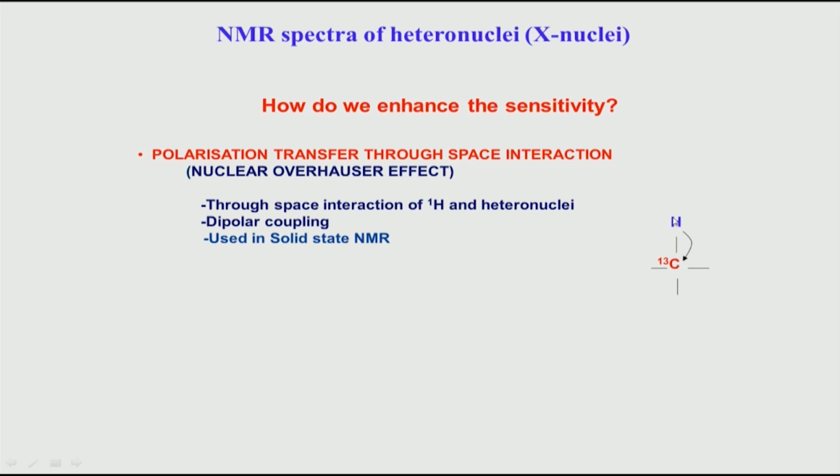One bond distance in molecules is about 1 to 1.5 angstroms. So, in that distance I can use that short distance, and remember, both of these are spin half nuclei, meaning they are magnetically active nuclei. What does it mean? It means they have a dipole moment.